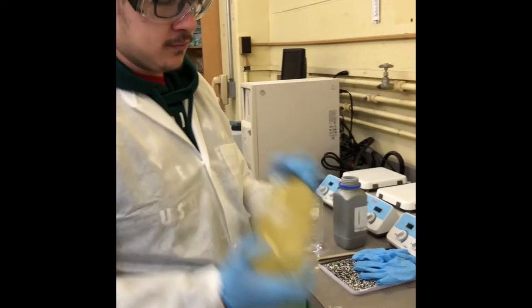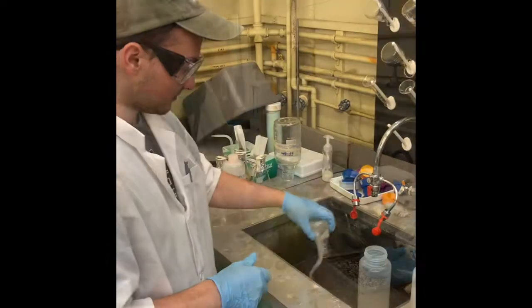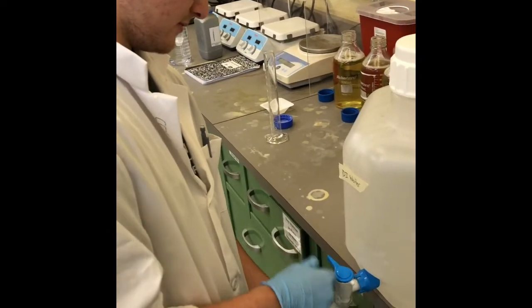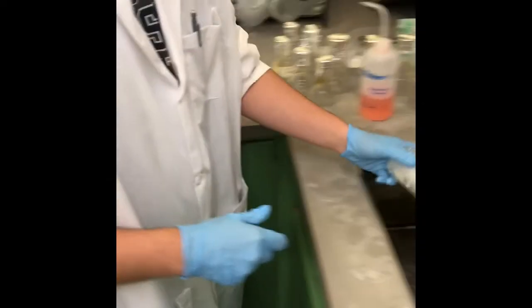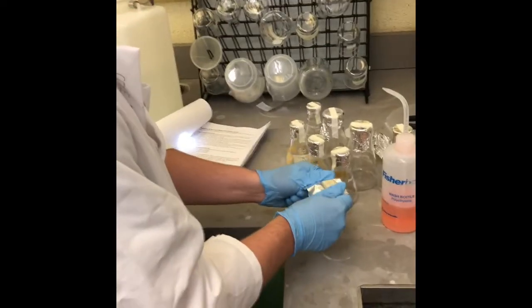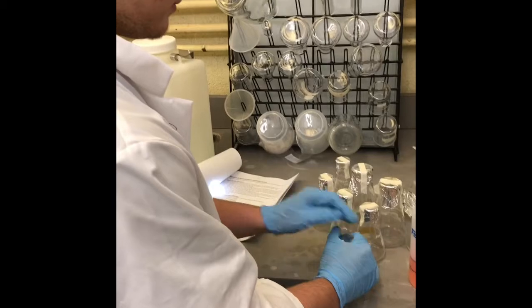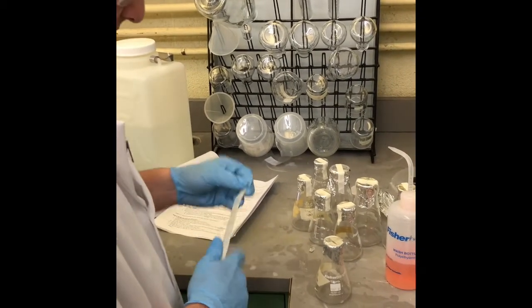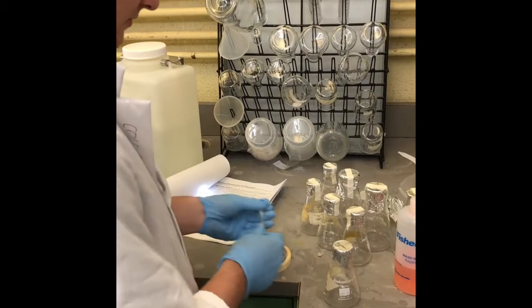We then ensured adequate mixing. In preparation for sterilization, all glassware, including funnels, Erlenmeyer flasks, and graduated cylinders, were rinsed with DI water and soap. The glassware was then capped with aluminum foil. A strip of autoclave tape was then placed across the foil. This was to ensure that the glassware was not tampered with and kept clean.